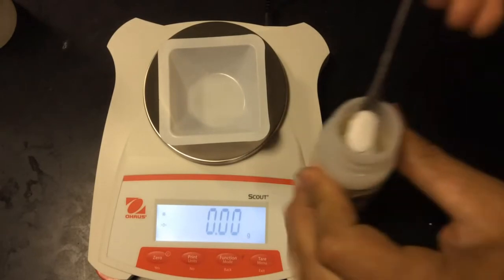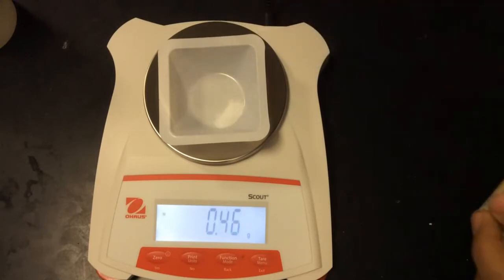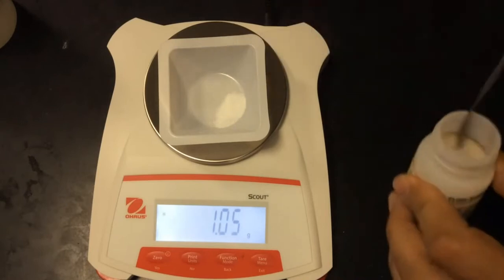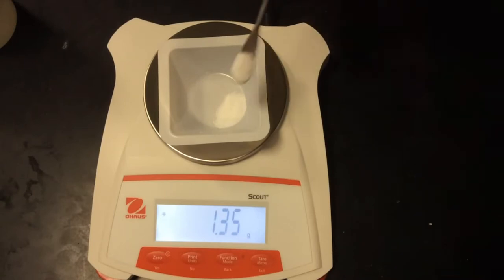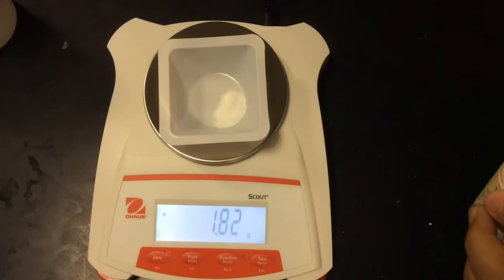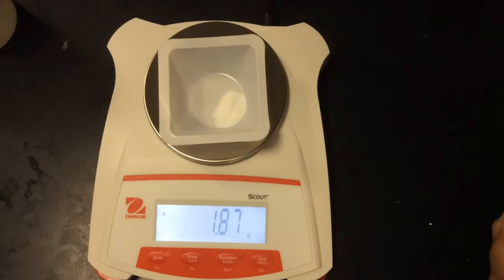Okay, so I got 0.46, and I'll have to spend 5 minutes trying to get 2 grams. The reason for around 2 grams is I've already done the mathematics here, and I want the salt to be the limiting reagent, not the precipitating ion. All right, so I want to add about 2 grams, and that's about good enough.